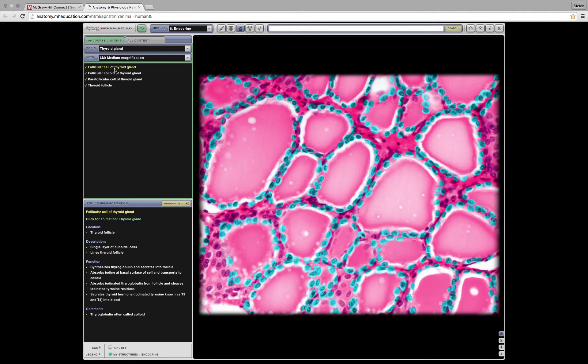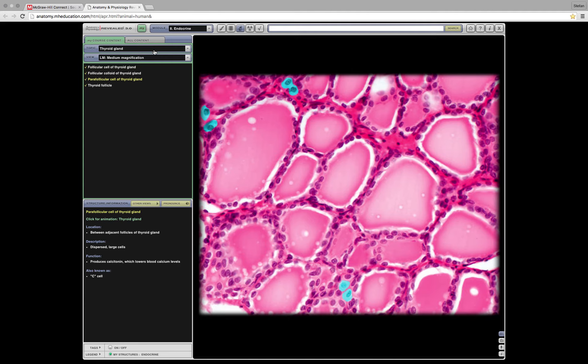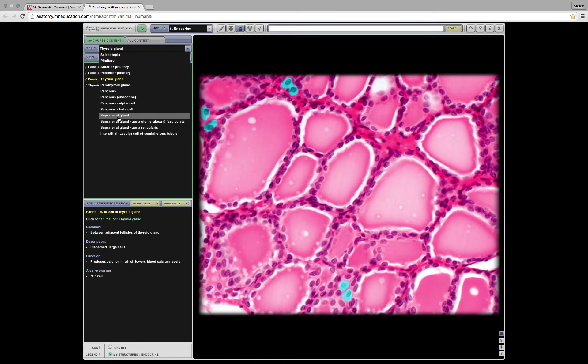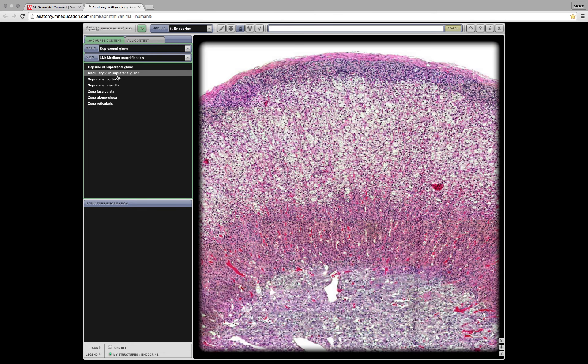Whereas the parafollicular cells secrete calcitonin. That's it for the thyroid gland. Moving on to the adrenal gland. Here we go. Suprarenal adrenal gland. Low magnification, is that enough? That's pretty good. What does medium look like? Okay, here we go.